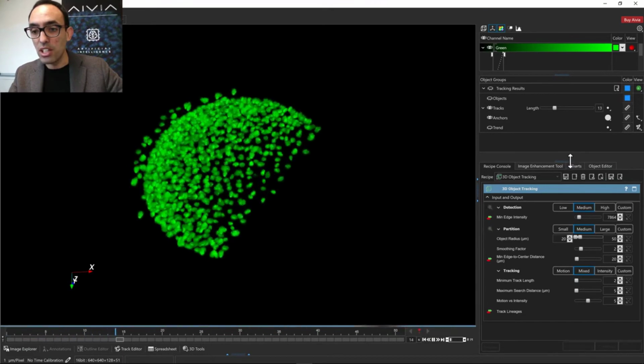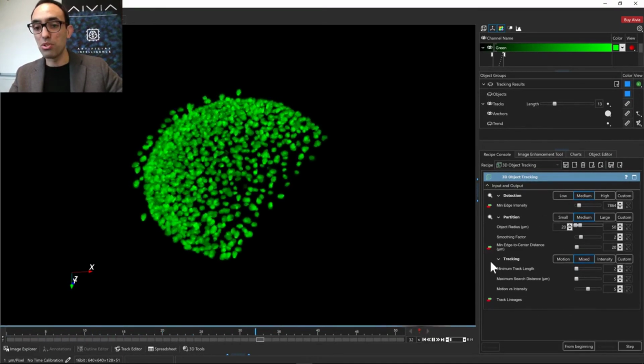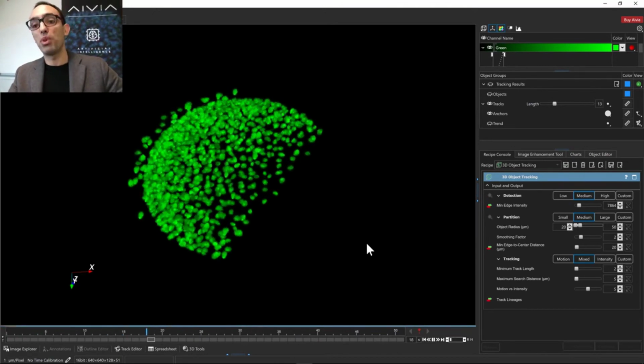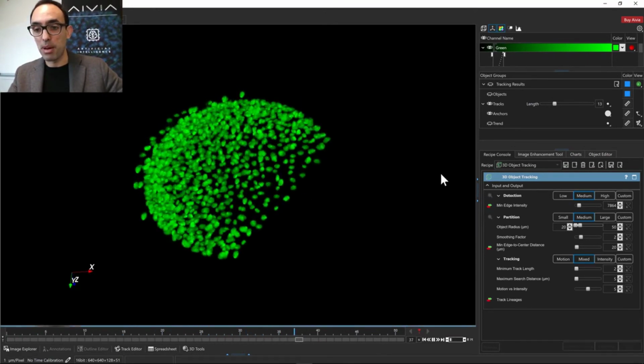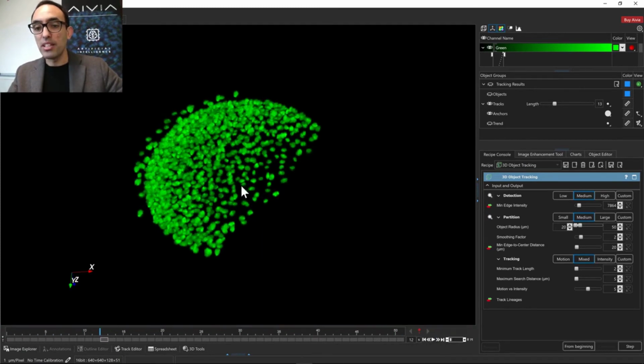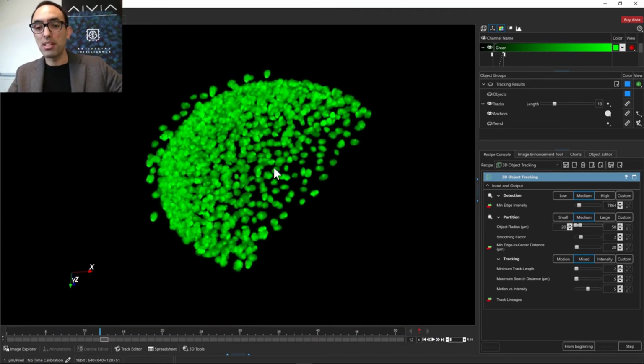You can edit each one of them independently and get a preview straight away, which is a very convenient way to set up the analysis pipeline. Okay, so that's the raw data. I've already done the analysis so that we don't have to spend time here, and I know that you want to try it anyway on your own data in your own time.